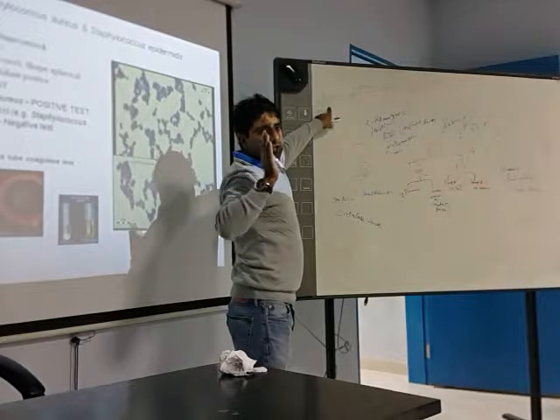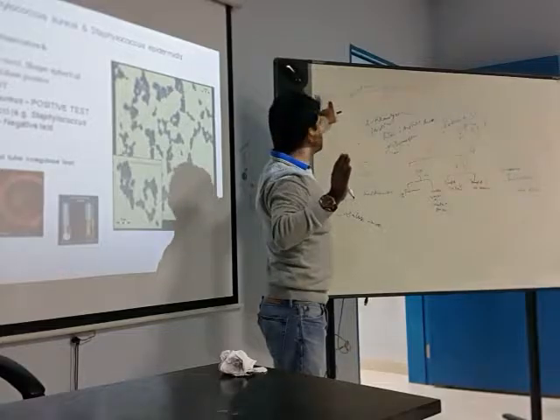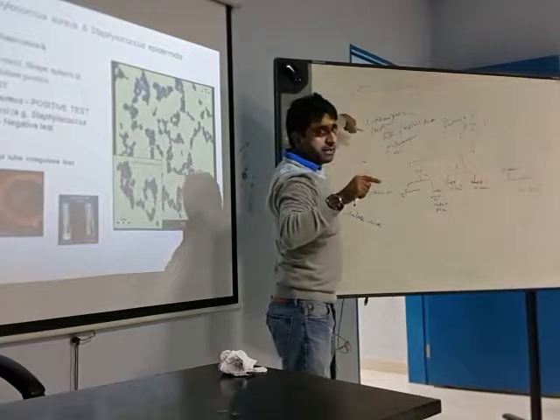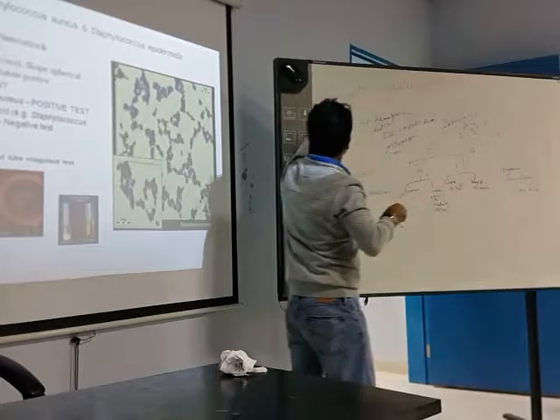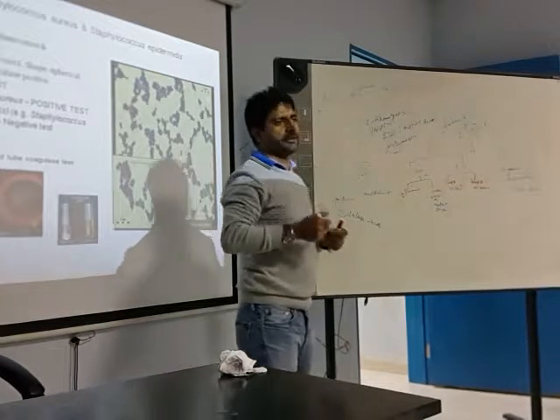Hydrogen peroxide is a free radical. It can destroy the cell. Free radicals usually damage the cell. When free radicals are produced inside the body to kill bacteria, but the bacteria has the enzyme catalase, this catalase is released by the bacteria and breaks down hydrogen peroxide into water and oxygen, making it less effective.